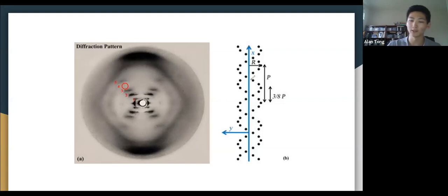Now, there are two helices here. How do I know that there are two helices? You actually look at the spacing. So here we see we have this row here, we have that row there, but we strangely have this one missing, and we have another one there. It turns out that missing fourth row is what clued Watson and Crick into thinking maybe there are two helices, and at that specific spacing, these waves just happen to destructively interfere. There's no spot there because the X-rays coming in from here and from there destructively interfered because there was a second helix in the way. I won't go into all the math behind this, but there is a way that you can back calculate from this diffraction pattern to figure out exactly how off-centered these two helices are.